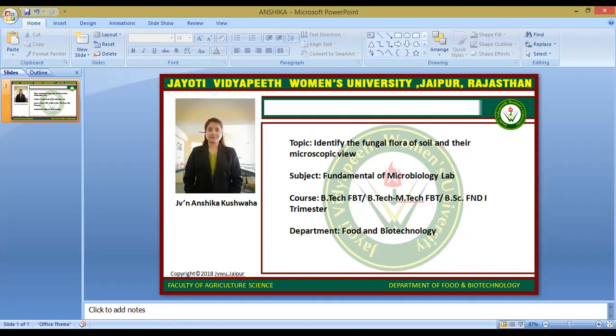This is how we identify the fungal flora of soil and then perform their microscopic observation. We prepare a slide of the prepared microorganism and observe it under the microscope. This is all about this session. If you have any queries, you can write in the comment section. Thank you.